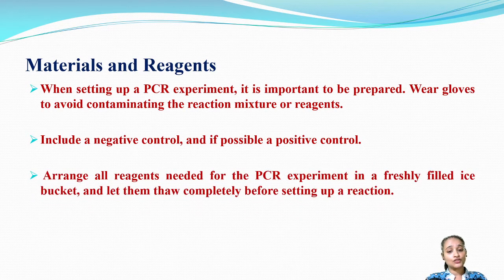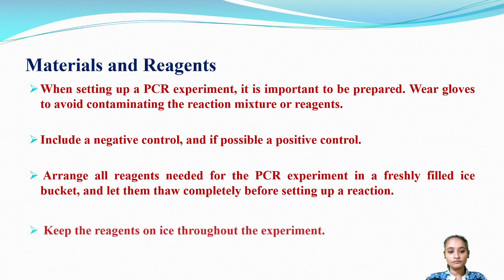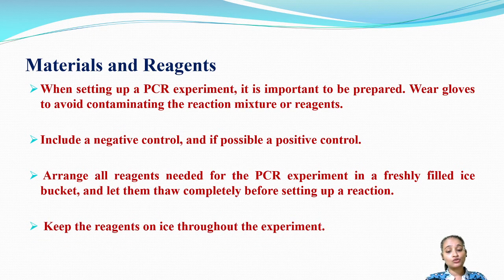Arrange all the reagents which are needed for the PCR experiment in a freshly filled ice bucket and let them thaw completely before you set up this PCR reaction, because you don't want any nuclease activity and degradation. That's why you need to carry out all your PCR steps in an ice-filled bucket and let all your reagents and chemicals thaw completely before you make a master mix of your PCR. Keep the reagents on ice throughout the experiment.